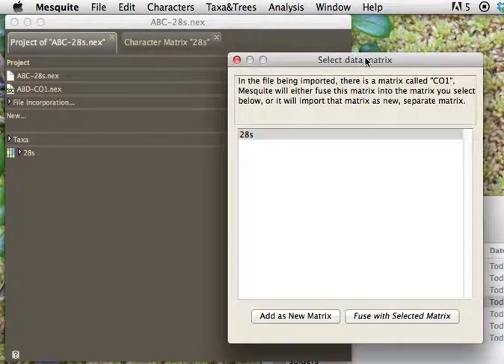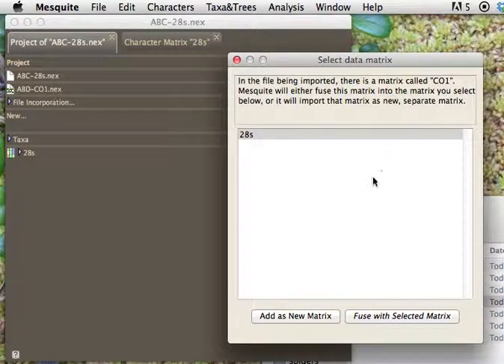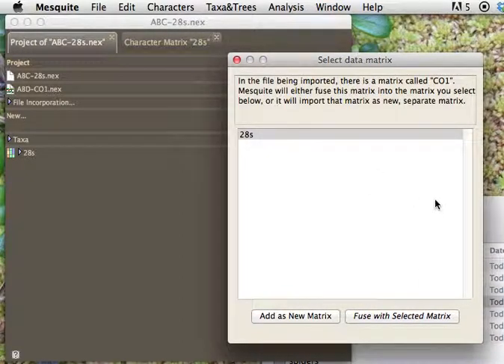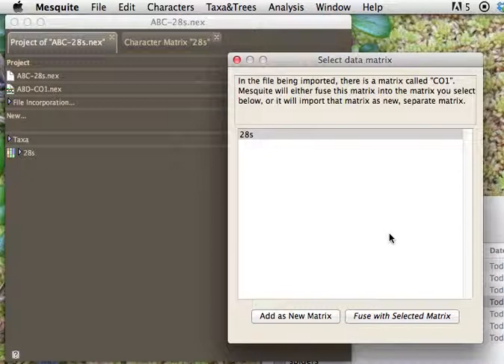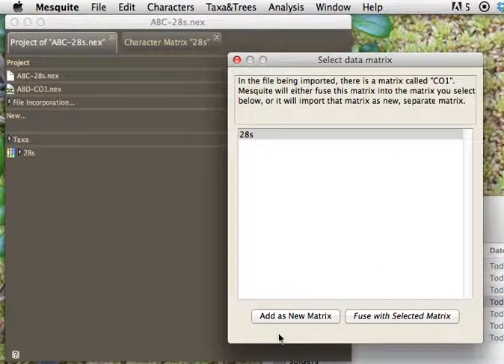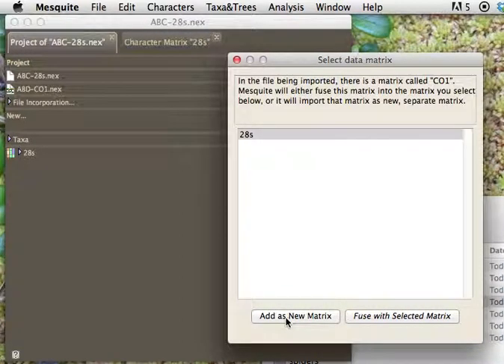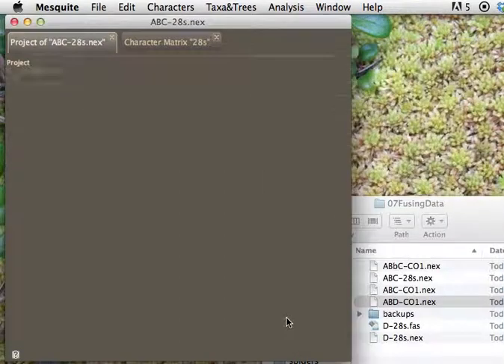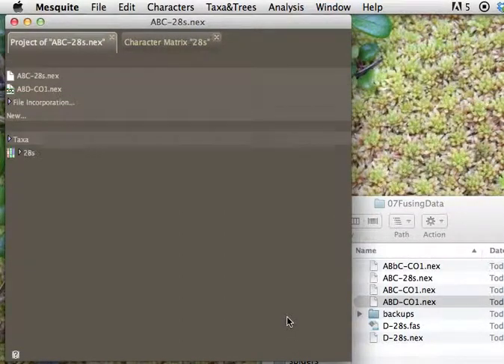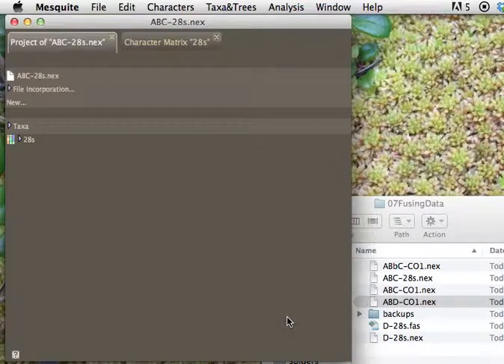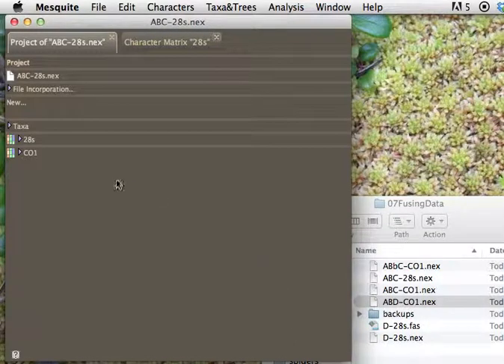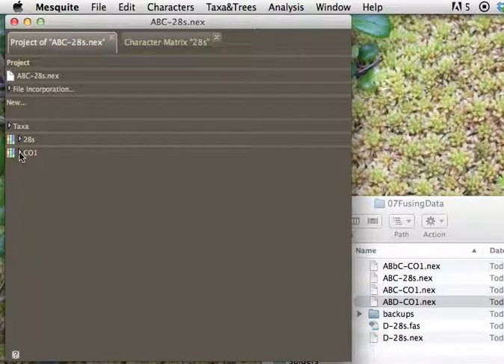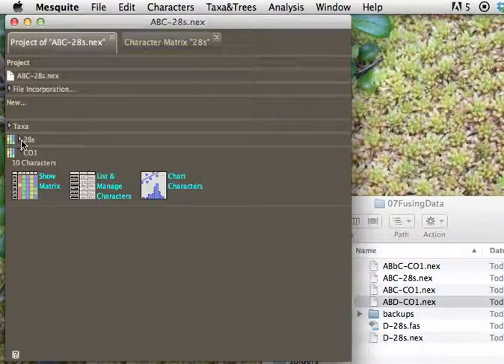And now it says, there's a matrix called CO1. What do you want to do with it? In this case, we don't want to fuse those sequence data with 28S. I'll show you something different about that, because that'll just overwrite what was there before, and of course it's not 28S, it's CO1. Instead we want to add the CO1 as a new matrix. And so now it's going to think a little bit. It's pulling it in, and it ends up with now two matrices.